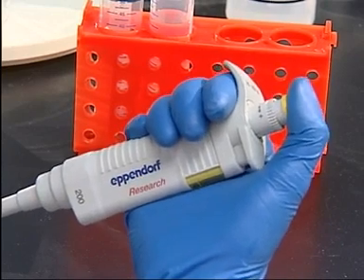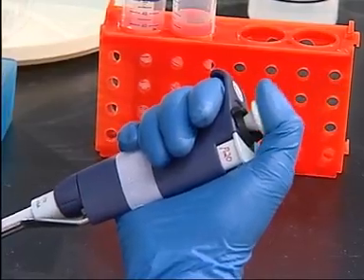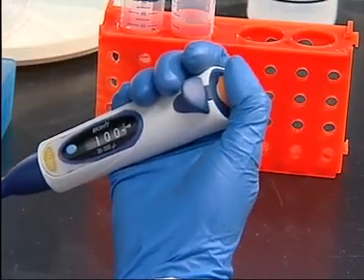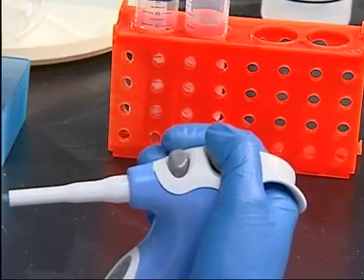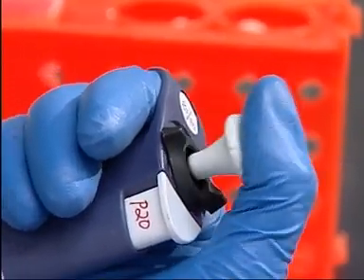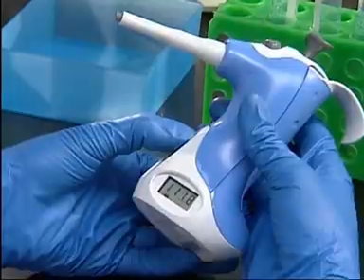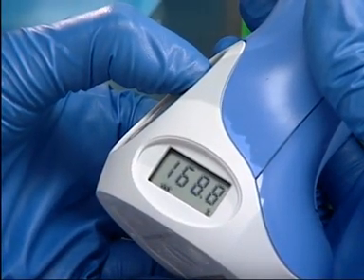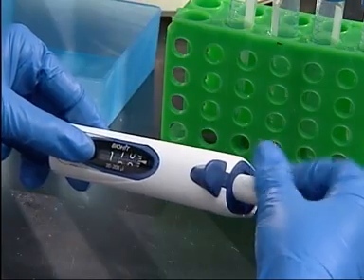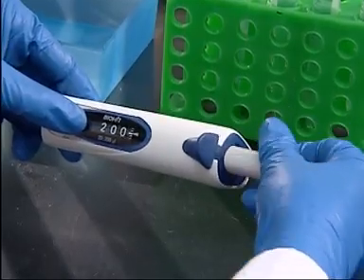When choosing a pipette, notice where the controls are located. Consider how far you have to extend your thumb to operate them. The further the thumb position from the palm, the greater the strength required to pinch and press controls. Control position, size, shape and surface texture are all factors to take into account when choosing a pipette. Volume adjustment controls are as important to consider as plunger controls. Recent studies have shown that volume adjustment requires the highest level of muscle activity during pipetting. Make sure the volume adjustment dial is easy to grip and requires minimum revolutions to adjust the volume.